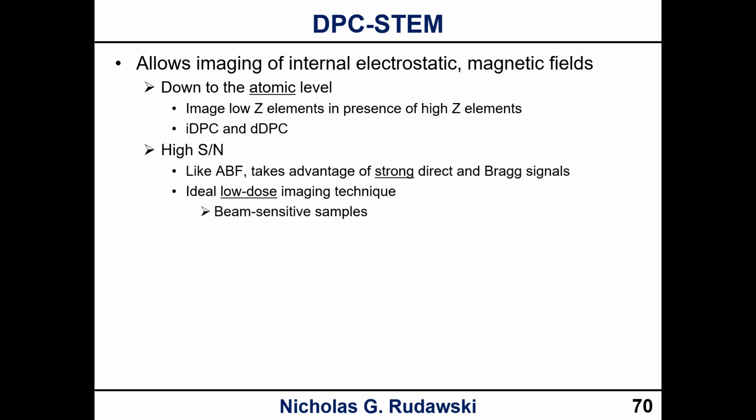This is also a high signal to noise technique. Again, we're taking advantage of those strong direct and Bragg signals. This is also another low dose imaging technique that works well if you're using a very low current, or you're working on a beam sensitive sample. The images are robust and intuitive.